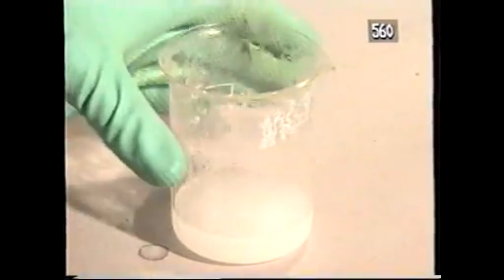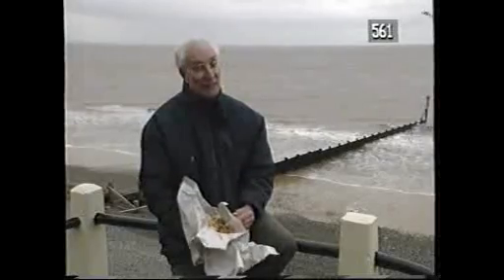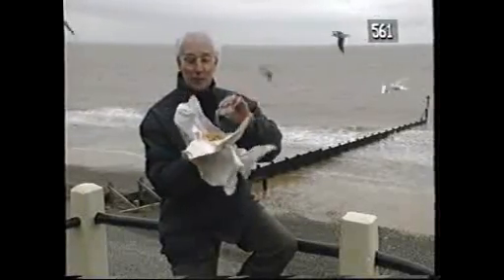What is left is ordinary salt. So concentrated hydrochloric acid and sodium hydroxide, each so corrosive in their different ways, react violently to give the harmless salt that you sprinkle on your fish and chips. The reaction I've just shown you is called a neutralization reaction. The acid and the alkali neutralize each other.